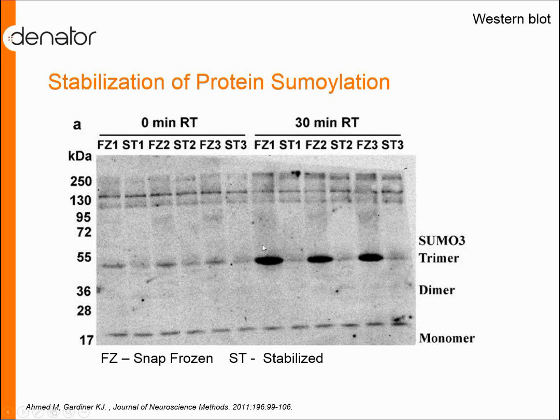So obviously the creation of this trimer is an ongoing process where it's being cleaved off from high molecular weight proteins in the upper area, and it ends up at this trimer. So an ongoing enzymatic process in the samples post-mortem or post-sampling.